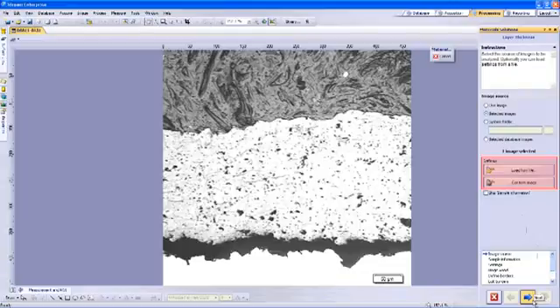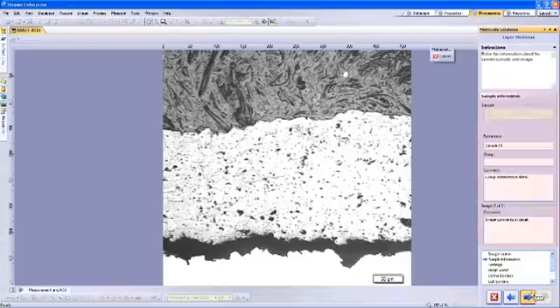Opening the settings at the start of this process will allow the utilization of standard values to increase repeatability in measurement results and also decrease the process time. Click the next arrow icon at the bottom to move to the Sample Information section.